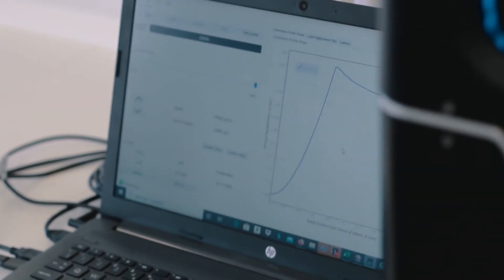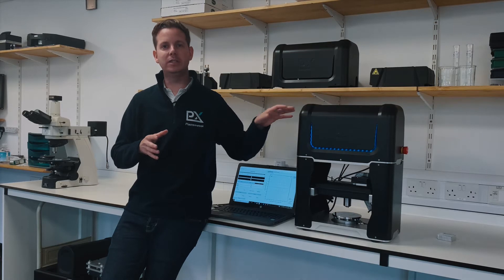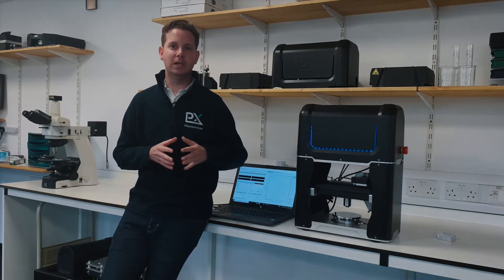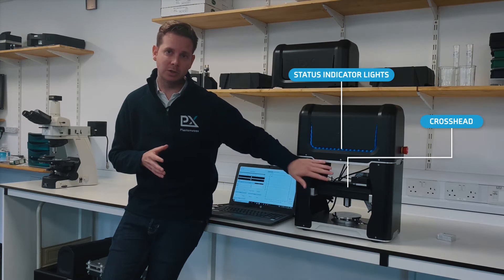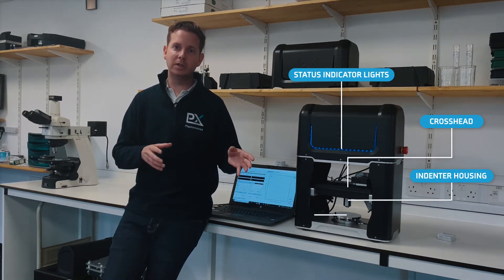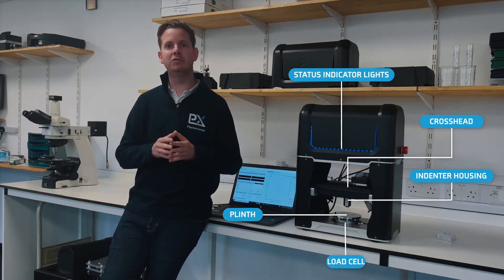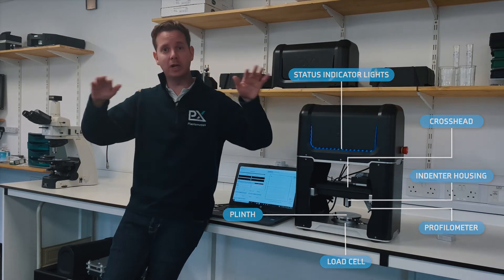So let me tell you about some of the features of the indentation plastometer. There is a mechanical loading frame rated to 15 kilonewtons, there are some status indicator lights, there is a crosshead which has translational motion, an indenter housing which houses a spherical indenter, a plinth on which to put the specimens, a load cell for measuring forces and an integrated profilometer to measure the residual profile shapes.